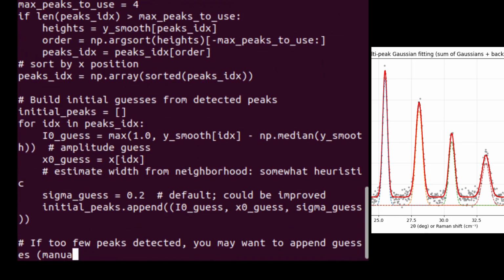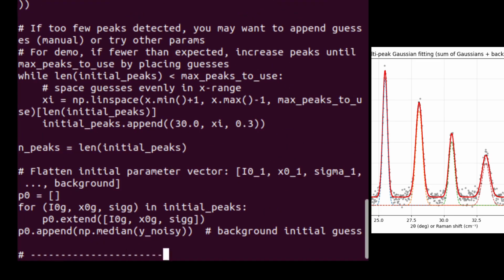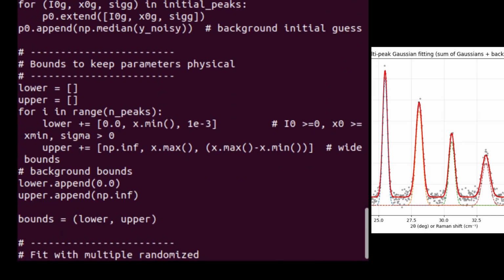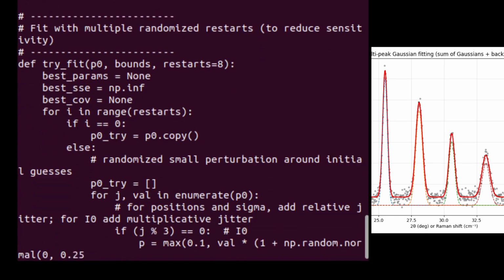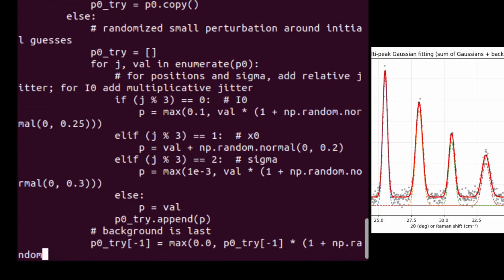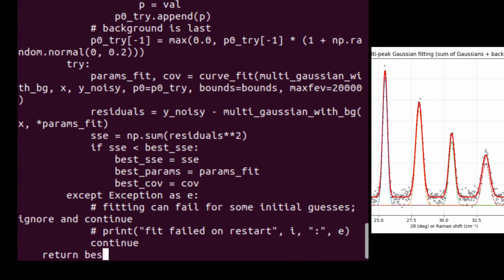So, when should we use correlation, and when should we use residuals? Correlation is best for database searches, comparing patterns under baseline or intensity variations. Residuals are best for curve fitting, extracting quantitative parameters, error analysis. In practice, the best workflow is to use correlation for pattern recognition and least squares fitting for parameter extraction.